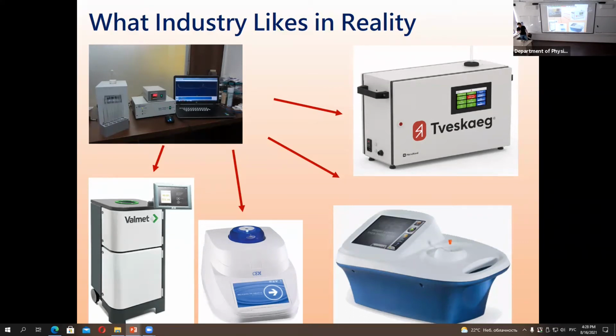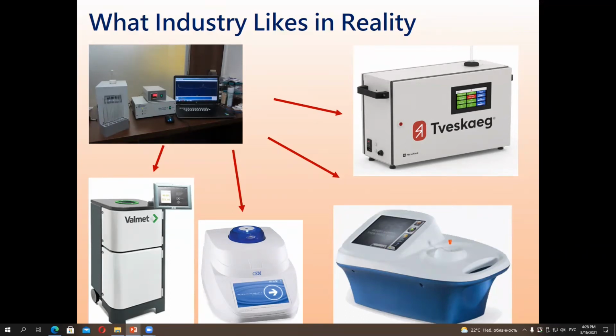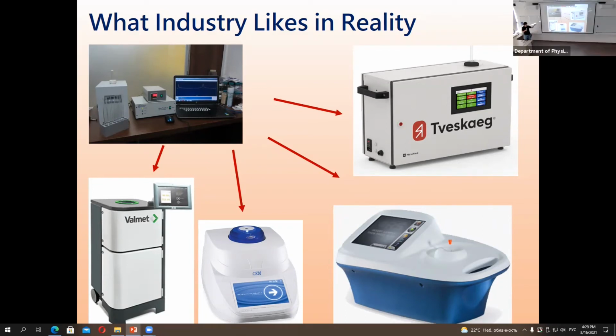So the room for that device doesn't need to be shielded. Oh, no. There is shielding inside. There are many different shielding inside. Okay. But this device complies with the declaration of conformity. You know, the sign of CE on many instruments, on each of your monitors, each of your mobile phones, you have CE. It means they fulfill the regulations of the European community to protect people from any kind of harm. So all of these guys, they have the CE mark. Everything is safe. Yeah, thank you. We can talk about this actually later.